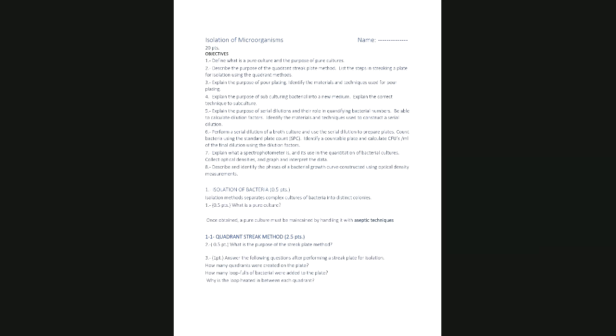All right. Can you repeat that last bit about the pour plate versus the spread plate? Which one does which? Is one only for counting, and the other one is for isolating also? Yes, so spread plate, count and isolate. Pour plate, counting only.